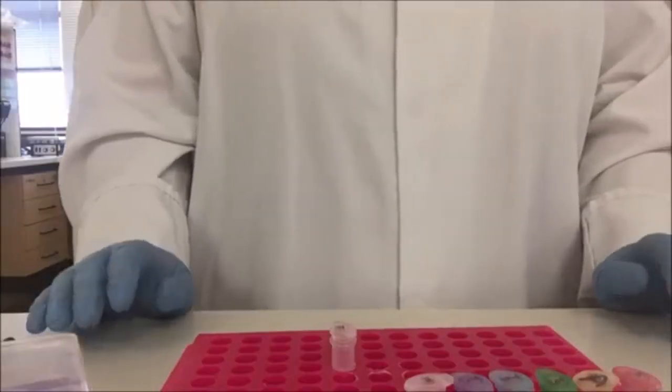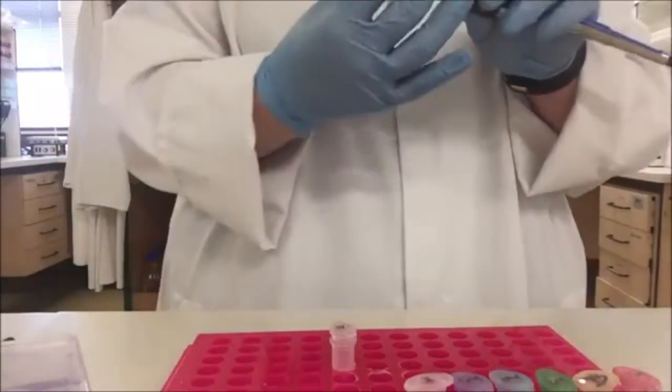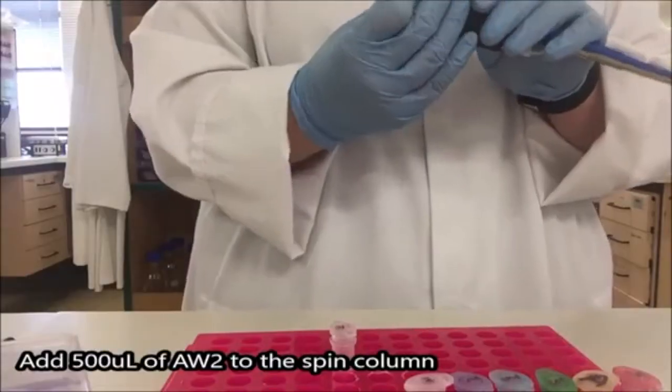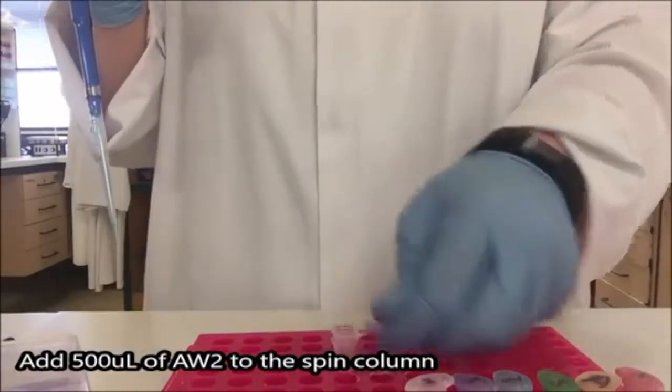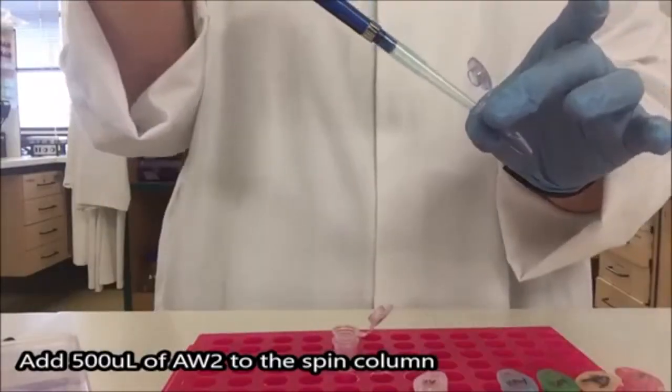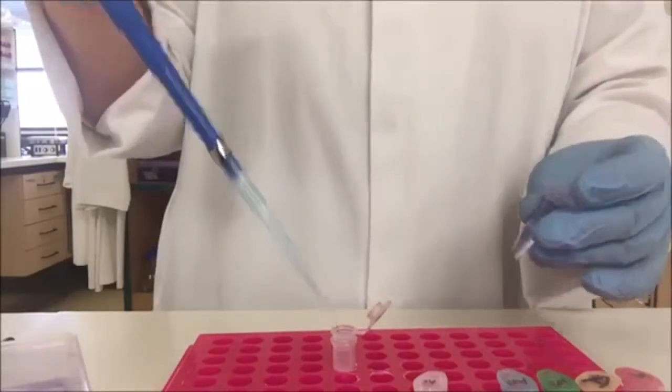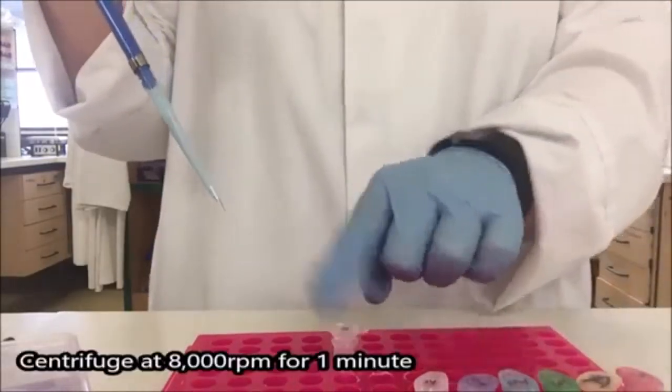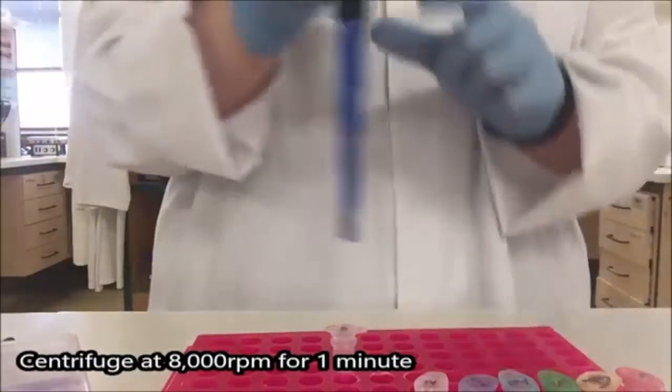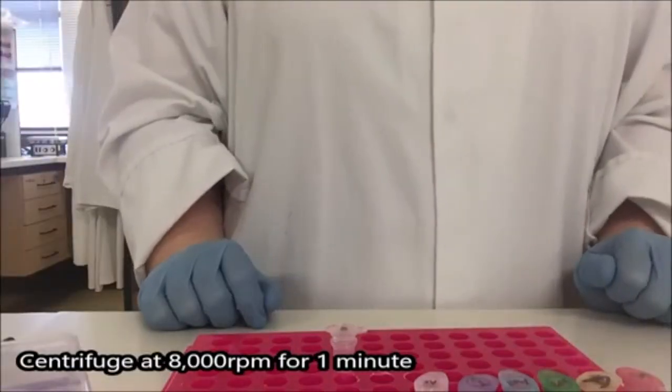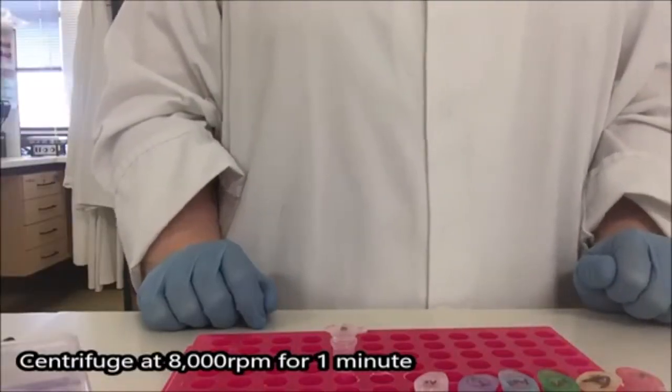I'm now going to go through the wash step, set my pipette to 500 microliters. And I'm going to add AW2 into the top of the spin column. Lid goes on, pipette into the trash. And I'm going to centrifuge this for one minute at 8000 rpm.